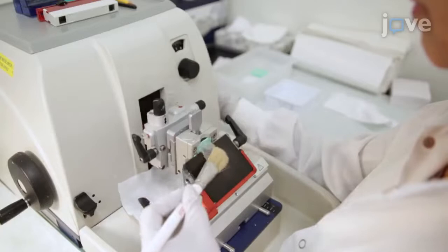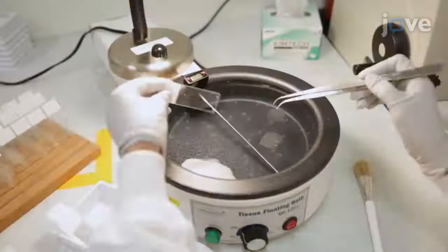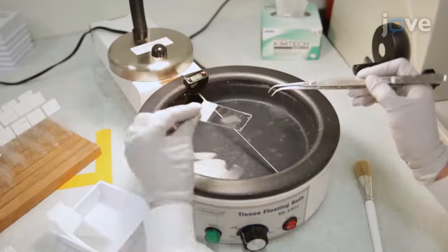Cut the embedded tissue into five plus or minus one micron sections using a microtome, mount the sections on electrostatically adhesive glass slides, and air dry at room temperature overnight.